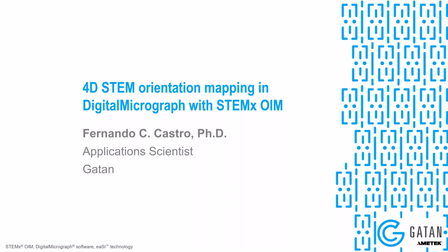Hello, everyone, and welcome to today's webinar, 4D STEM Orientation Mapping in Digital Micrograph with STEMx OIM.